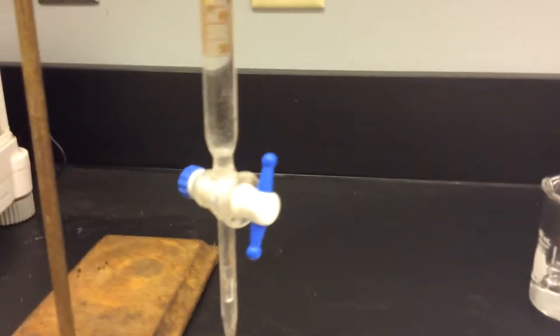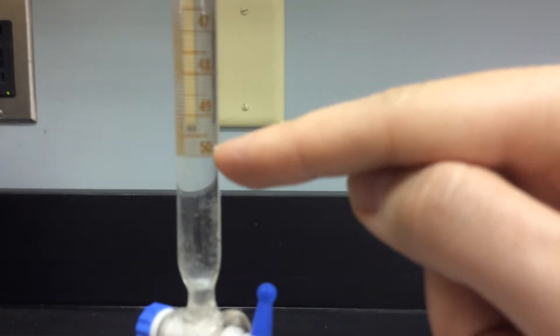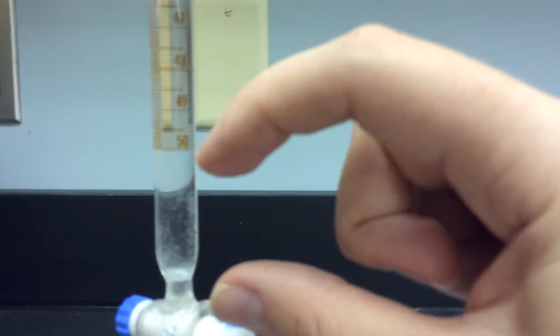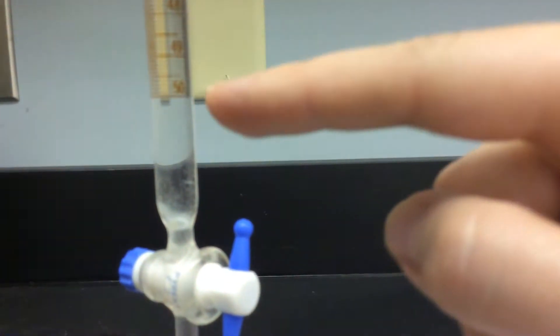Now when you're using a burette, one of the important things to remember is that you need to stop it when the meniscus reaches this line right here. Because otherwise you'll dispense this volume right here, which you have no idea what it is. So you're actually dispensing way more than you expect if you go all the way out. You want to stop the draining right there.